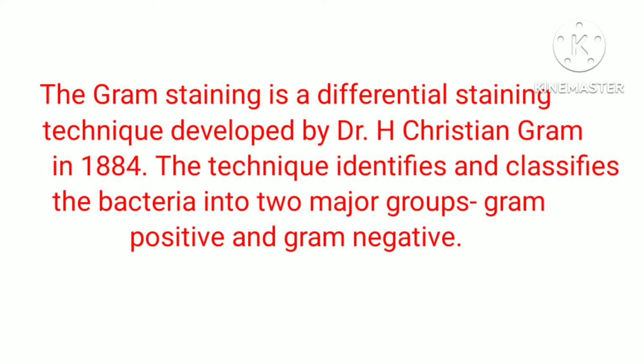The Gram staining is a differential staining technique developed by Dr. H. Christian Gram in 1884. The technique identifies and classifies the bacteria into two major groups, Gram-positive and Gram-negative.